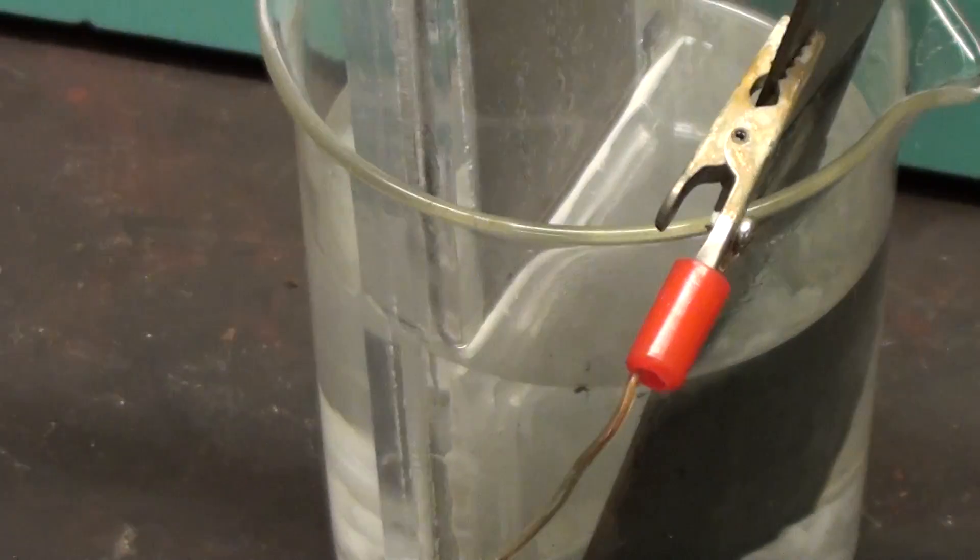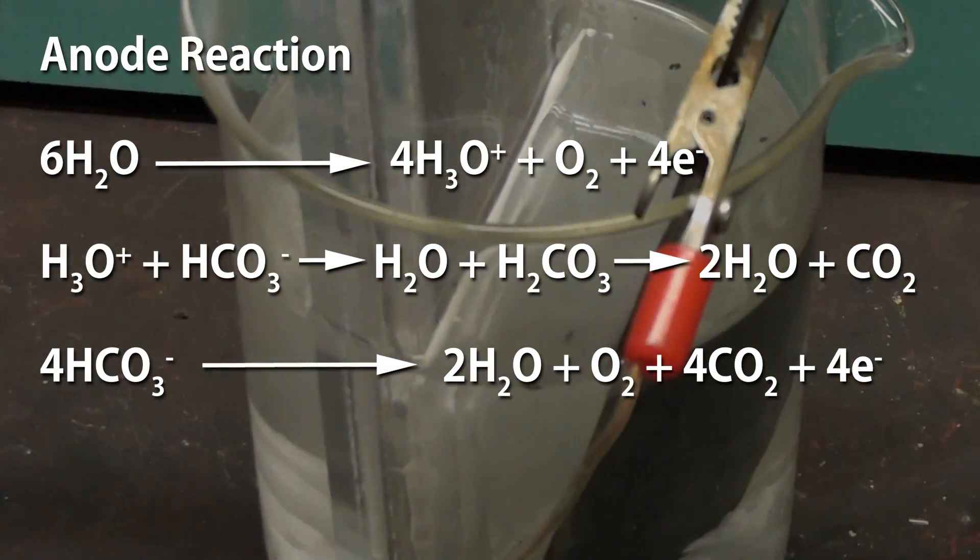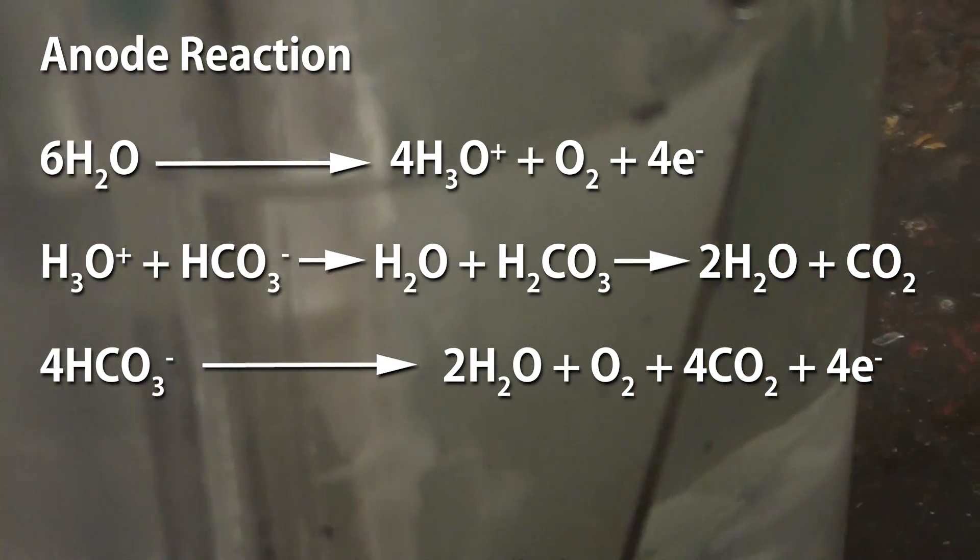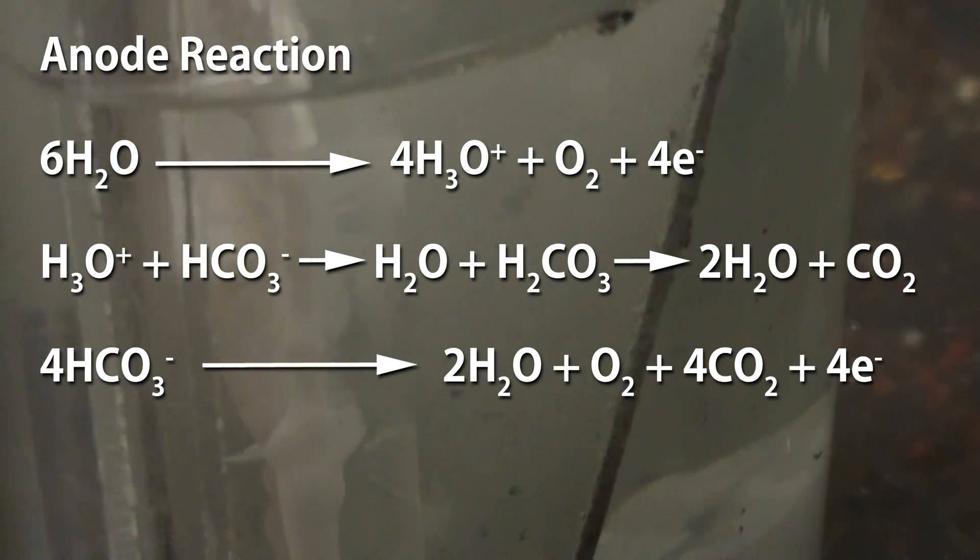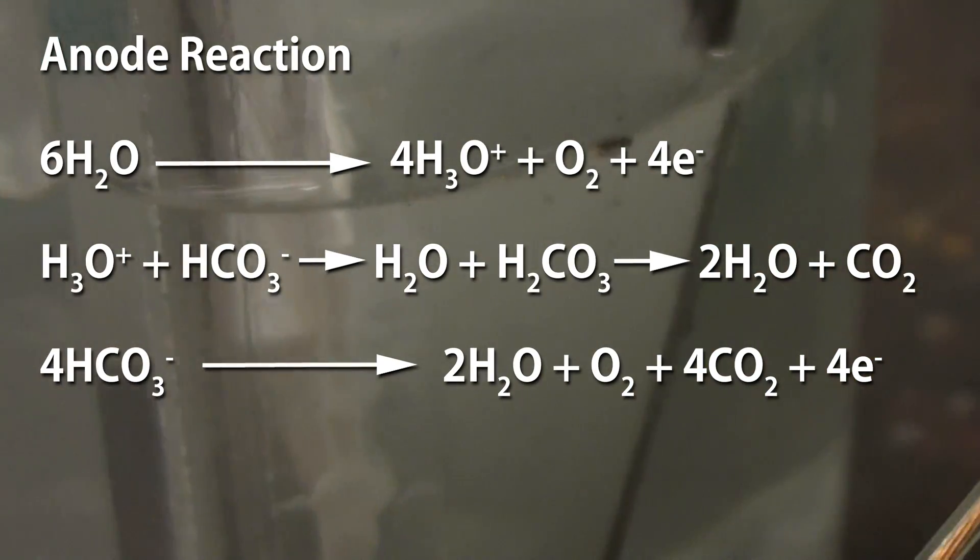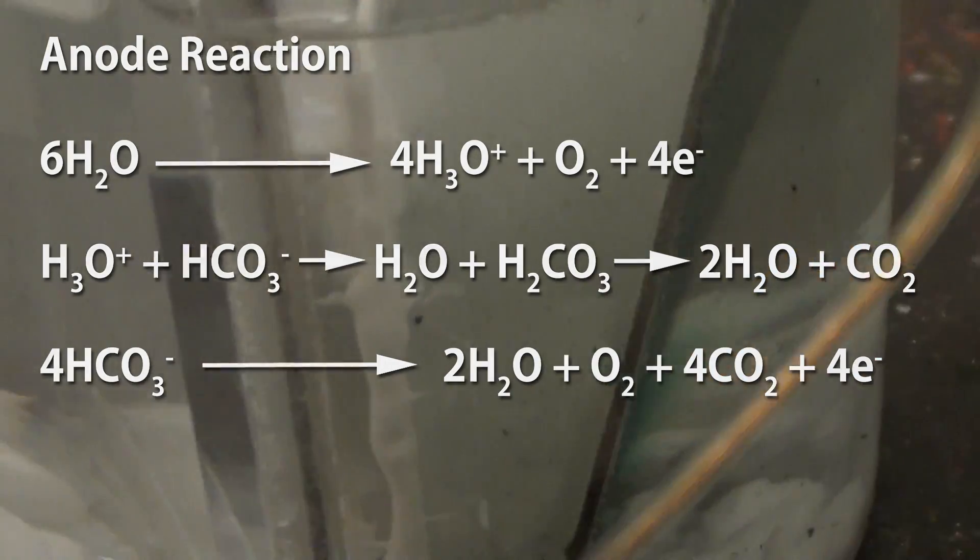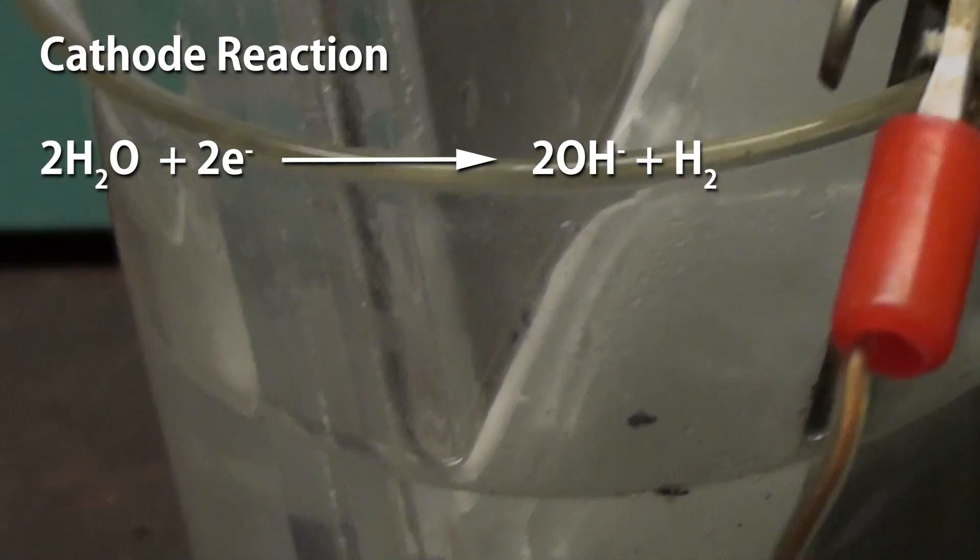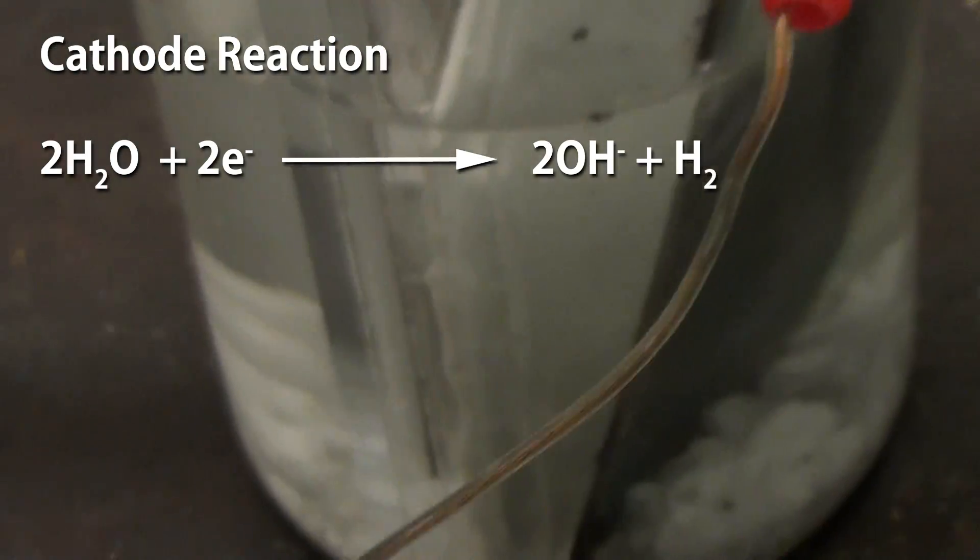So what's happening? At the anode we're electrolyzing water and producing oxygen gas and hydronium ions. These react with the bicarbonate and liberate carbon dioxide as well. So we're releasing oxygen and carbon dioxide at the anode. At the cathode we're electrolyzing water and releasing hydrogen gas and producing hydroxide ions. So far that's all pretty boring.